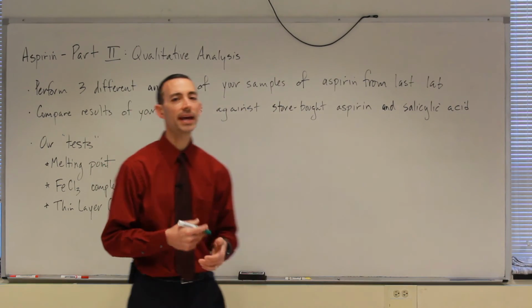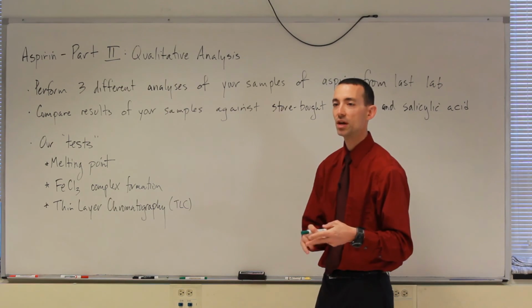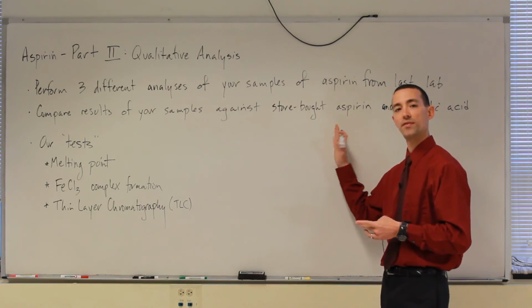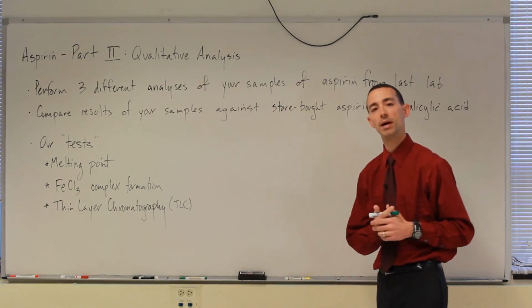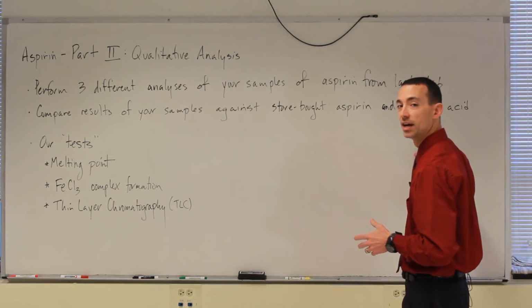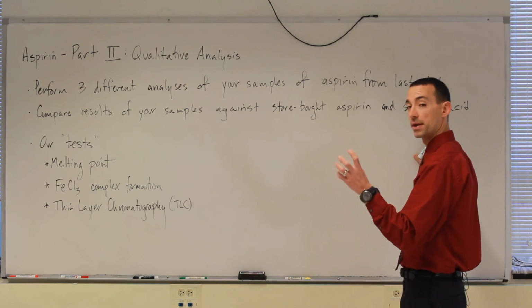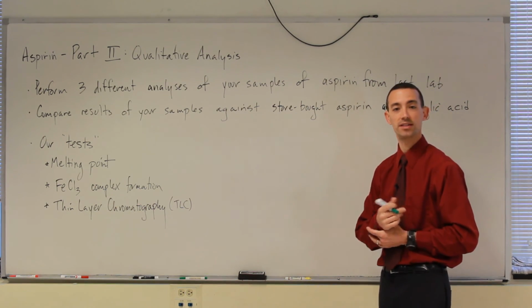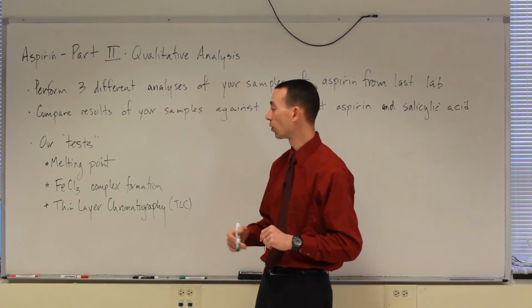Then you'll engage in a series of three different tests on your aspirin samples, salicylic acid, and store-bought aspirin. The store-bought aspirin is sort of a control to see how our sample compares to what you might be able to buy in the store. And the salicylic acid is being tested, again, to show that before and after. Is what you're looking at and believing to be aspirin different than what you started with last week, the salicylic acid?